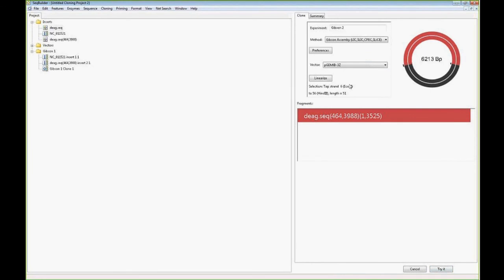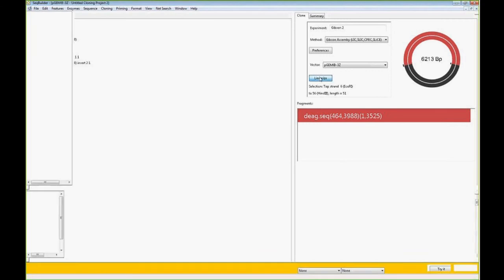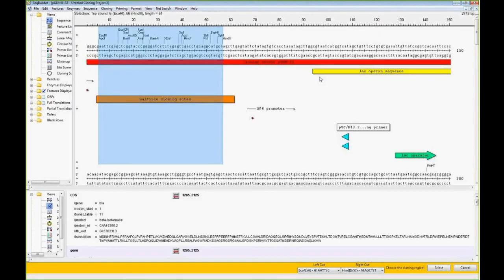Thanks. There's actually another question that is also about that display, which is what determines which restriction enzymes are displayed when you're doing that linearization?